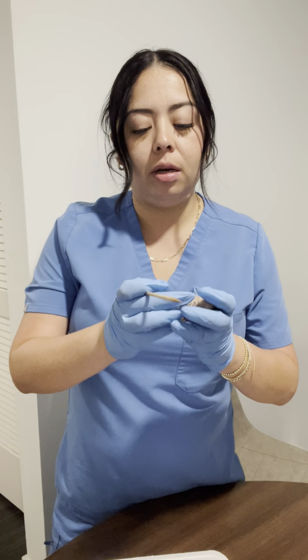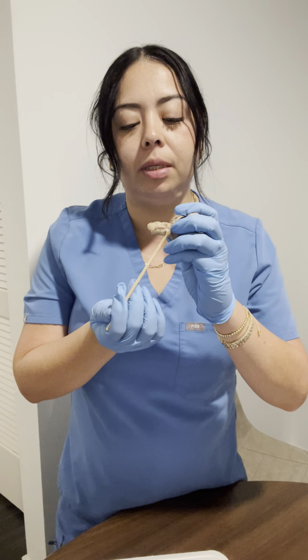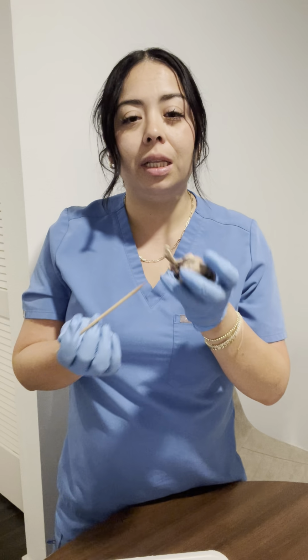And then we have the optic nerve again, but we want to see the optic disc or blind spot, which is basically the starting point of our optic nerve, and that helps send visual information over to our brain.